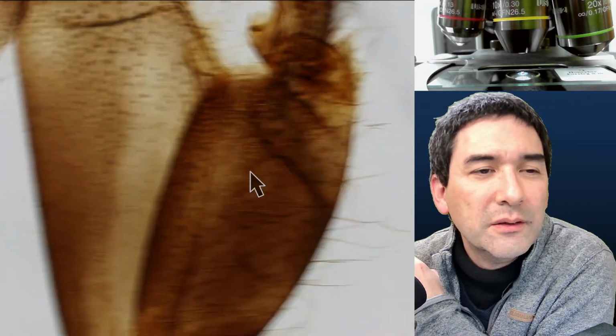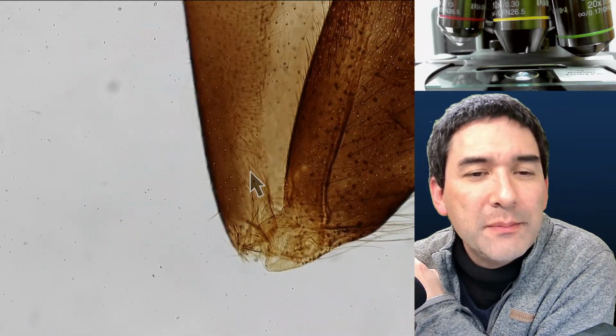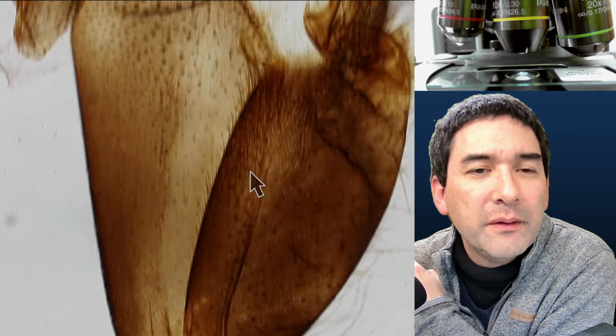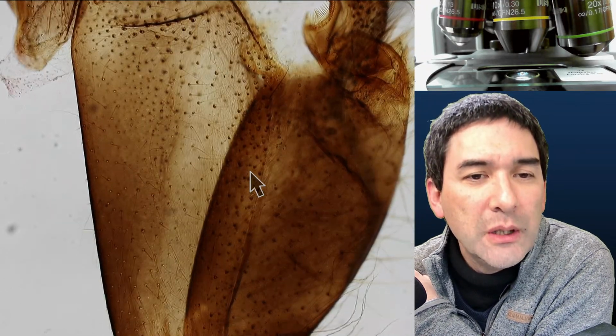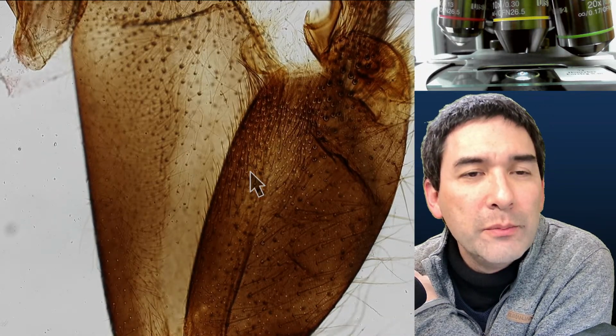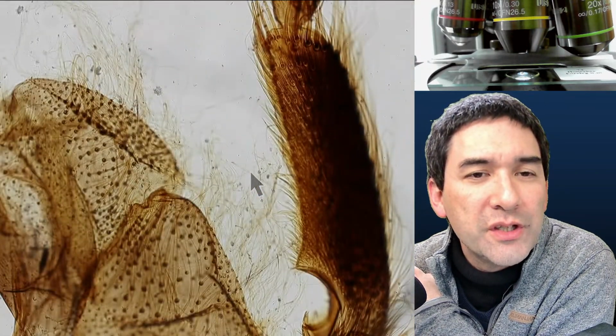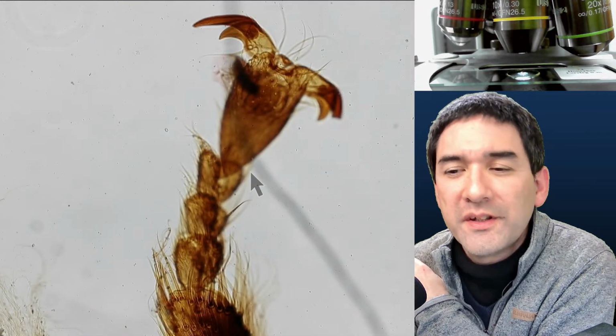Interesting still. Yeah, but I think all of those specimens look very, very thin, which is actually good. But this actually means that probably the contents have been removed during the preparation of the specimen.